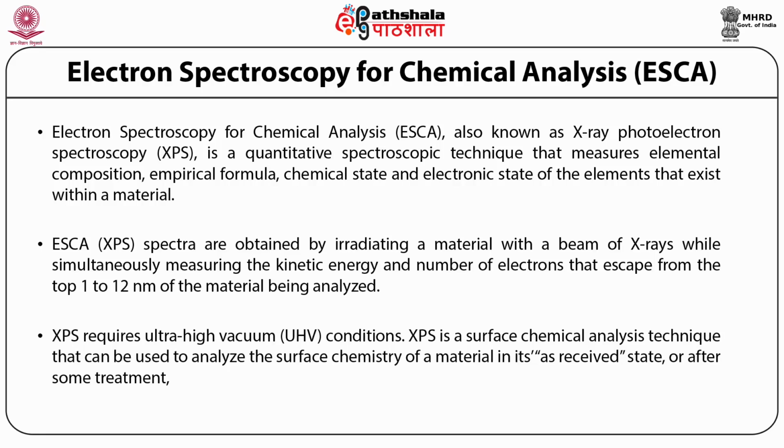XPS is a surface chemical analysis technique that can be used to analyze the surface chemistry of the material in its as received state or after some treatment, for example fracturing, cutting or scraping in air or ultra high vacuum to expose the bulk chemistry, ion beam etching to clean off some of the surface contamination, exposure to heat to study the changes due to heating, exposure to reactive gases or solution, exposure to ion beam implant, exposure to ultraviolet light.